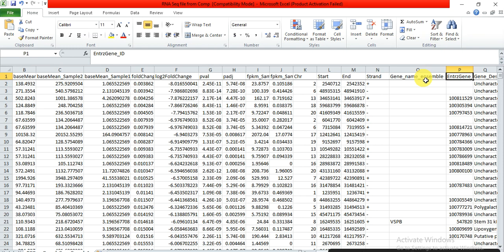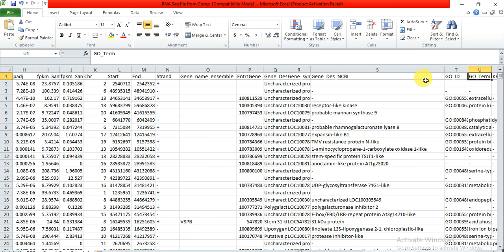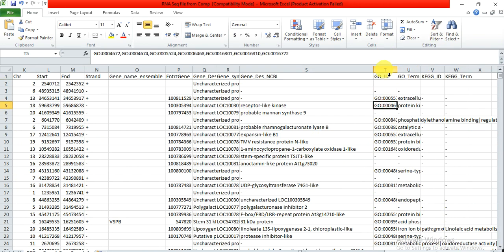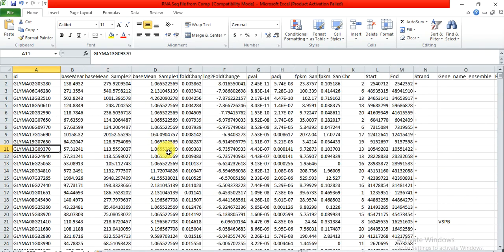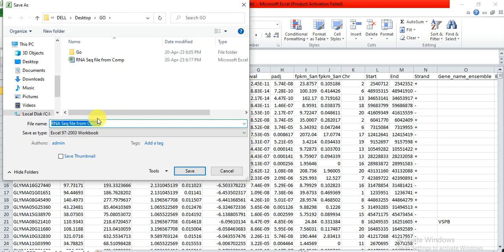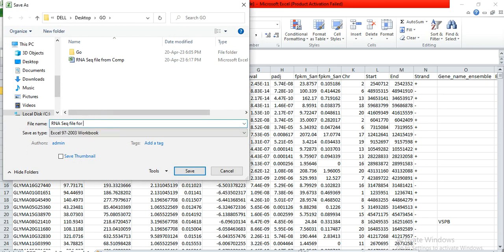The file also has the gene symbol in NCBI. However, we only need two columns from this file: the GO ID column and the gene ID column. We don't need the other data. To prepare this file for analysis, first save it in your folder as an RNA-seq file for GO analysis.